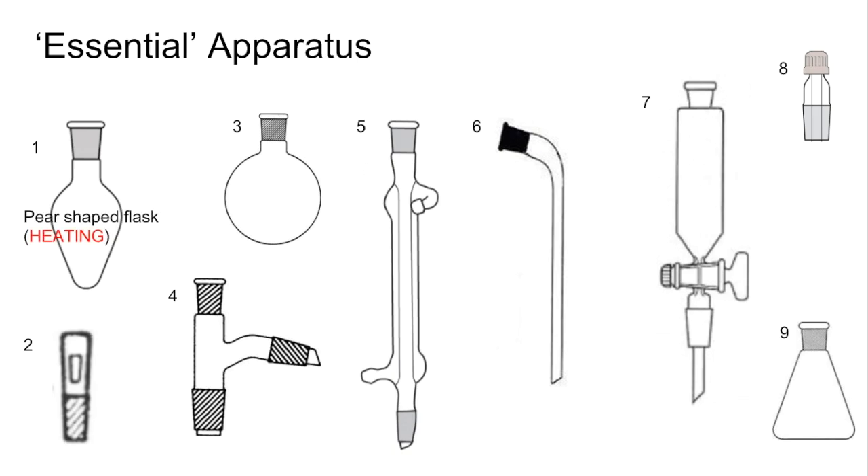Number one is a pear-shaped flask, used for heating. Number two is a glass stopper. Number three is a round-bottom flask, also used for heating. Number four is what we call a still head.